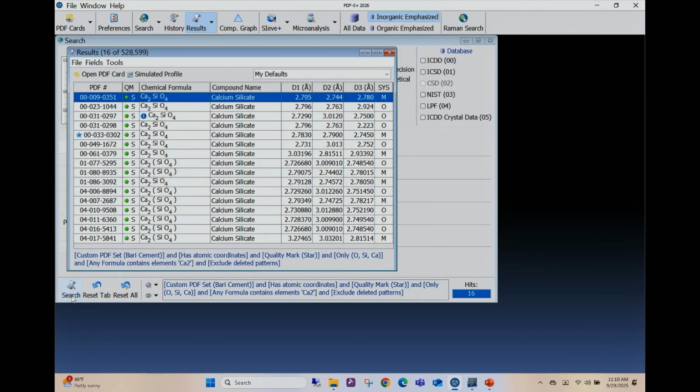Okay. Now, earlier question was asked this morning, can someone save their own data to the powder diffraction file? And I'll emphasize the point, the answer is no. It can be saved in the JADE software, and if we have time, I'll mention that. But the reason is that the database, because of our ISO certification, we have to say that you can't go in there and alter it. Now, why would someone want to alter it? Say they wanted to see a phase that they wanted to just change the data a little bit there. Okay, the data has to stay as is.